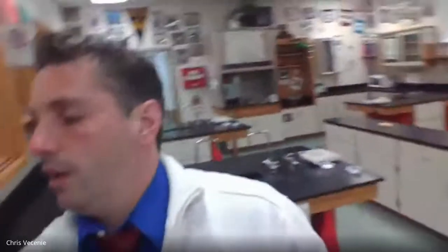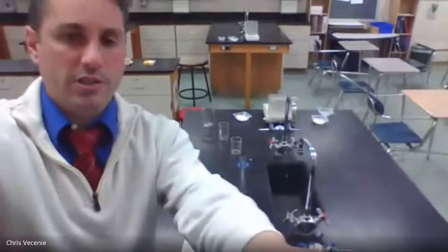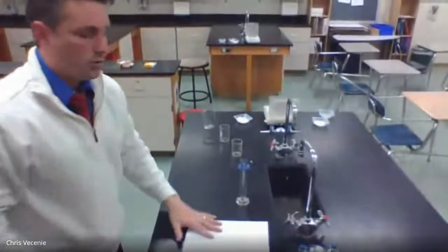This is one of the few labs where pretty much everything we're working with is fairly harmless. So today, if you had been in person, you would see we don't need to wear goggles.